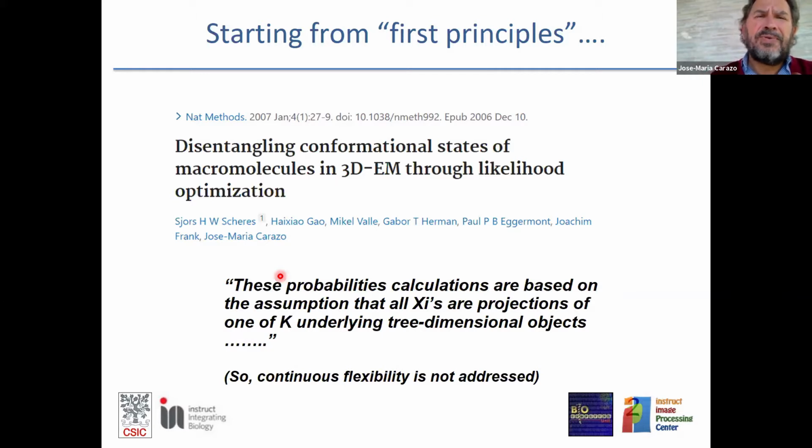Still, none of these approaches is widely used in the community because probably they still need quite some development. But clearly, principal component analysis, which is the simplest approach that allows for continuous flexibility, is out there. It can be used in situations in which you do not have classes, and therefore anything you do is going to be unstable and, within quotation marks, beyond specifications. It is highly recommended. Okay, thank you.